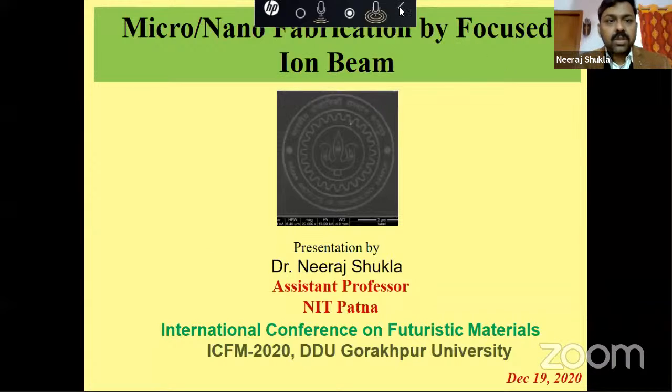So as proposed, I'll be talking about micro and nano fabrication by focused ion beam. Okay, and so this is the logo of IIT Kanpur, which we made using focused ion beam, and the length scale you can see is 2 micrometer. And so this will be like how micro nano fabrication is achieved using focused ion beam.